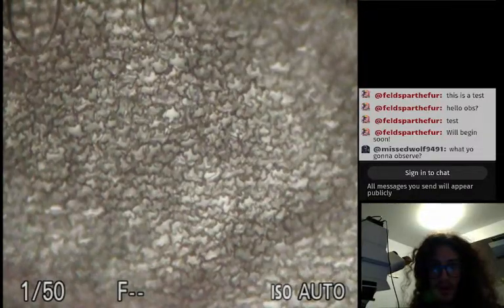And here we have little cells in the leaf. So many of them. It's really cool, you can kind of see the pigment barrier. Let's see, I'm going to switch magnification in a little bit. So there may be a flash. We're at 10x right now. I say we go to 20.